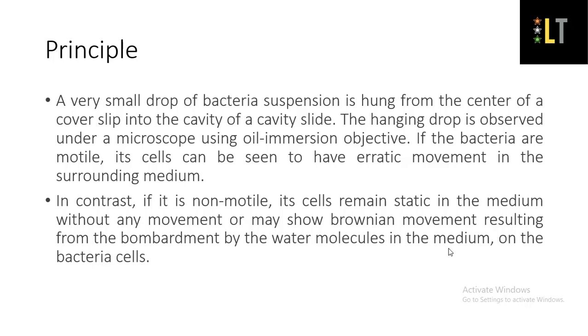Now, bacteria are usually divided into two classes. First is the motile bacteria and the other is the non-motile bacteria. Motile bacteria are the bacteria which can move from one place to another with the help of flagella or any other organs for locomotion, whereas non-motile bacteria cannot move from one place to another.